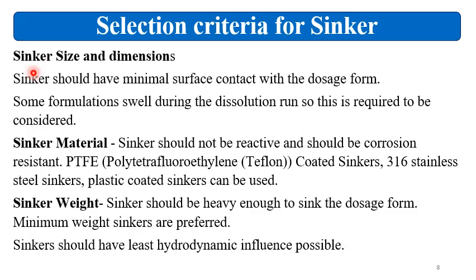Then sinker size and dimensions. The sinker should have minimal surface contact with the dosage form. Some formulations swell during the dissolution run, so this is required to be considered. If your formulation shows swelling, then you should ideally select a little bit bigger size sinker.